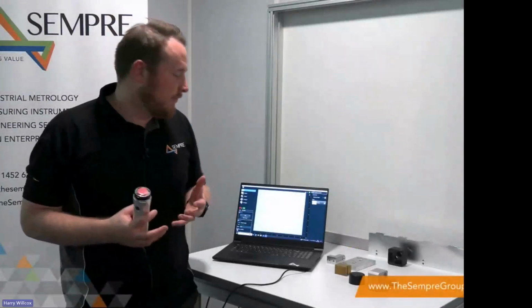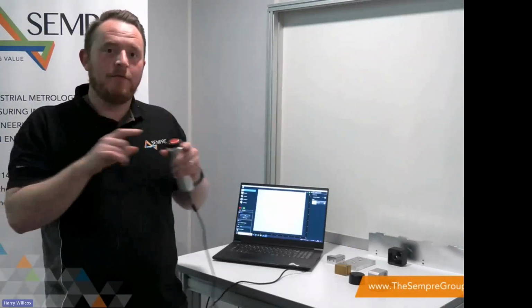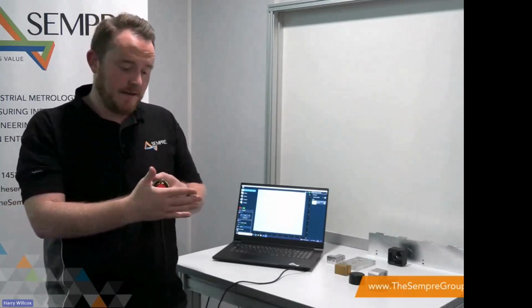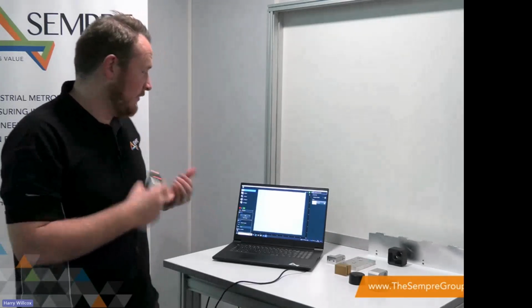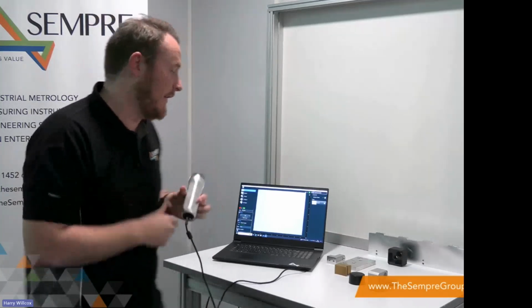Within the latest version of the Gelsight software, we've got something called defect detection. The way that this works is we can define a boundary within the field of view of the pad, and if we place a defect into that area, it will automatically detect it. We'll characterize the length, the width, the depth, and the volume automatically. The main benefit to this change is that we can run the routine automatically within the software. If I place the pad against the surface and click the button, it'll automatically do all the information for me. I don't have to draw any boundaries or anything like that.